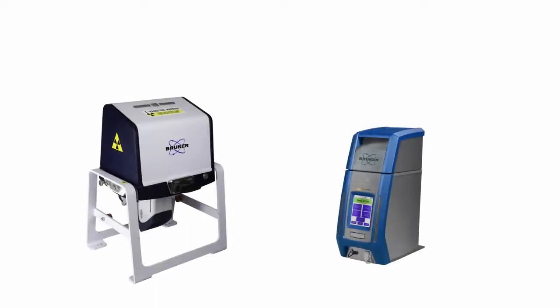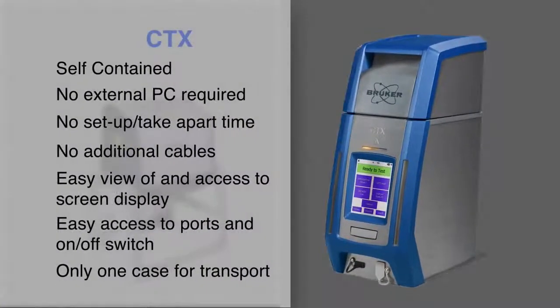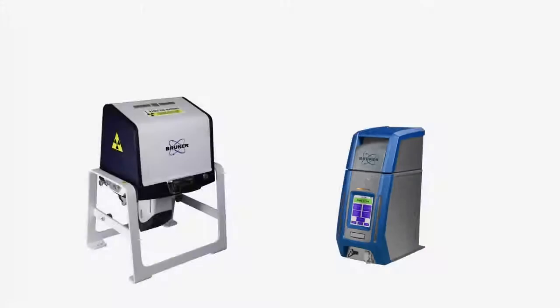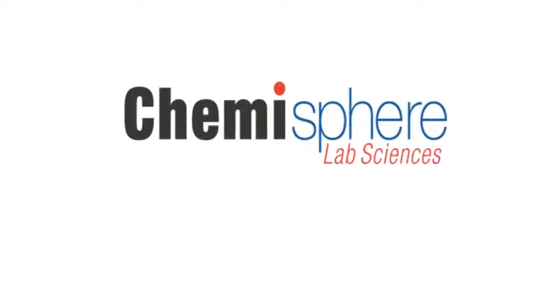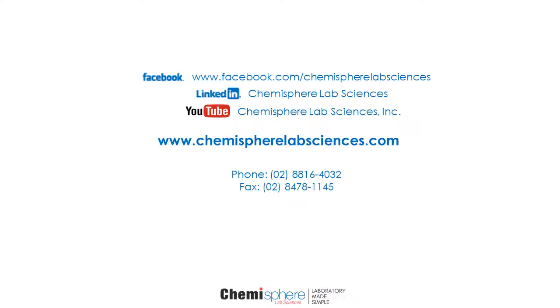An optional benchtop stand can be purchased with the S1 Titan, which makes the decision to purchase the CTX or the S1 Titan a tough one. Comparably priced, the CTX is self-contained with easy viewing of and access to the screen display, ports, and on-off switch. But the Titan can measure in situ when not in the benchtop stand.